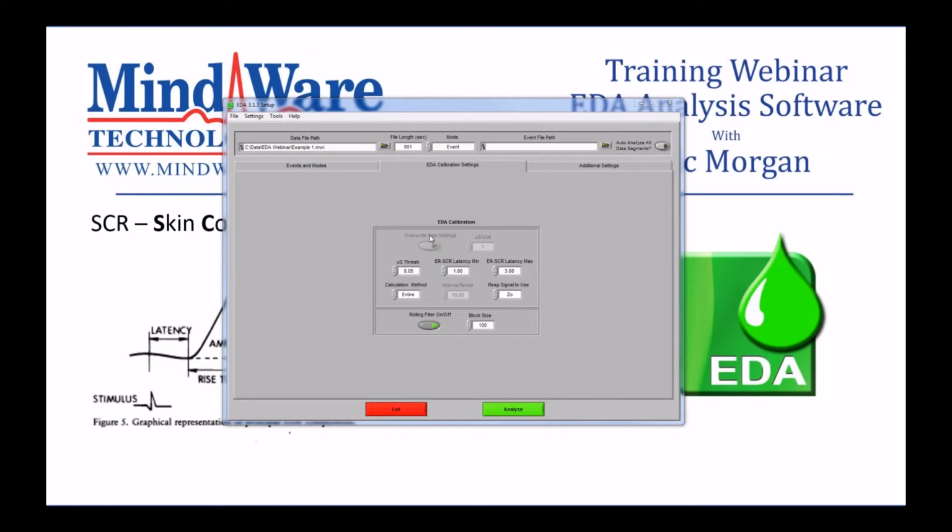The first setting we see here is actually grayed out because I'm using an MWI file from the MindWare Mobile. What's nice about using the MindWare Mobile is it can scale the data automatically into the proper units for EDA, which is microsiemens. Since I'm using a file that was acquired on a mobile, this setting is grayed out because it's already being done for us.